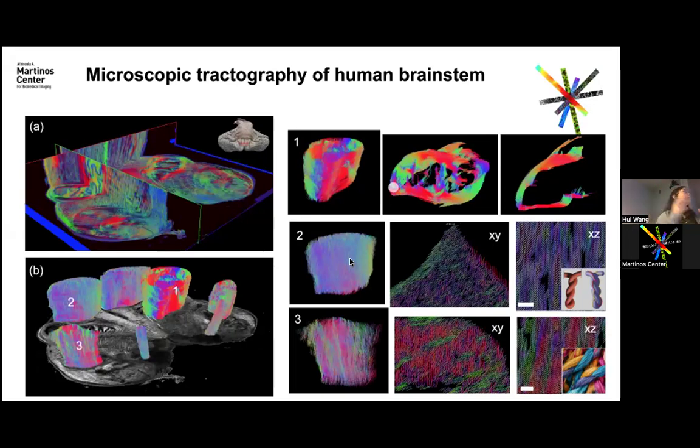They all turn to go into, for example in 2, the superior-inferior direction in general, but they don't go parallel in this direction. Instead, they kind of do this thing to go up and down. That's the detail that's revealed by the PSOCT.